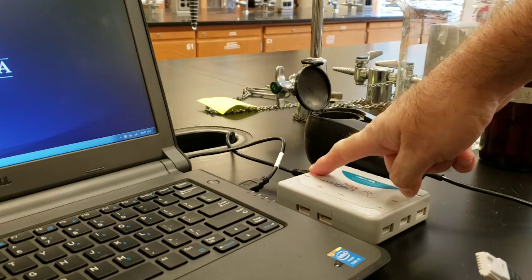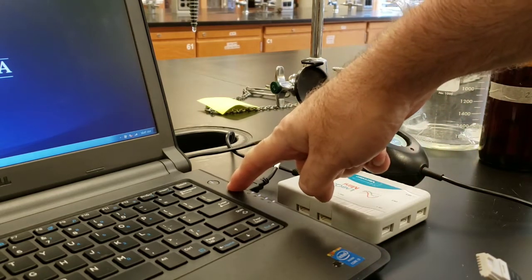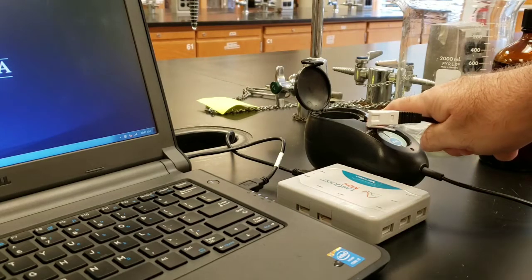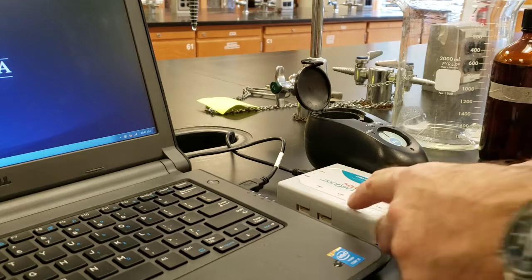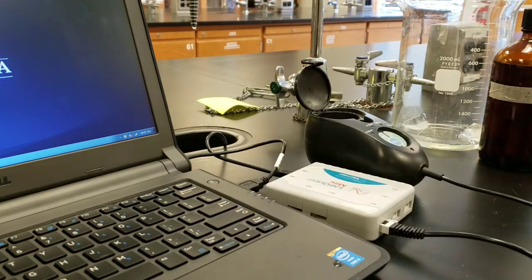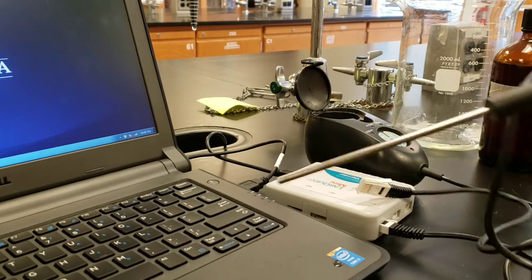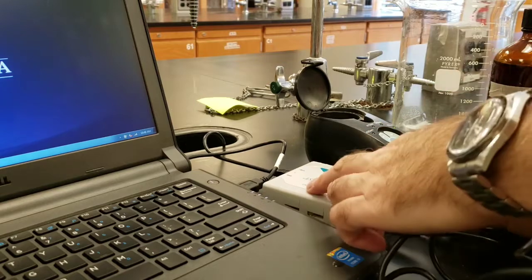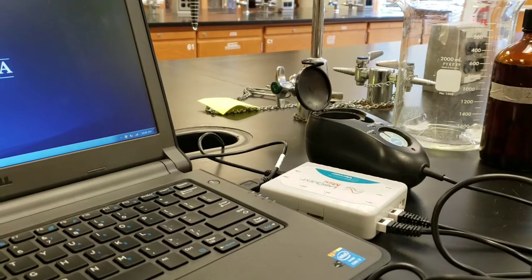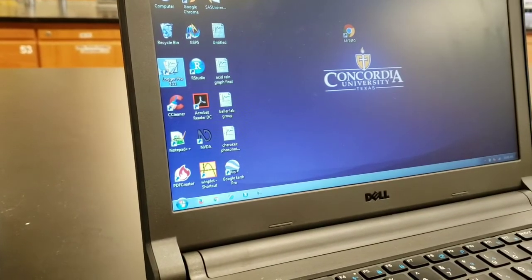Connect the LabQuest Mini interface USB to the USB of the laptop, then connect the colorimeter to channel 1 of the interface and connect the temperature probe to channel 2. Then, on the laptop, open Logger Pro.